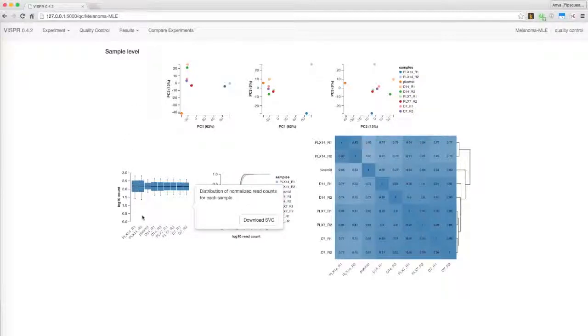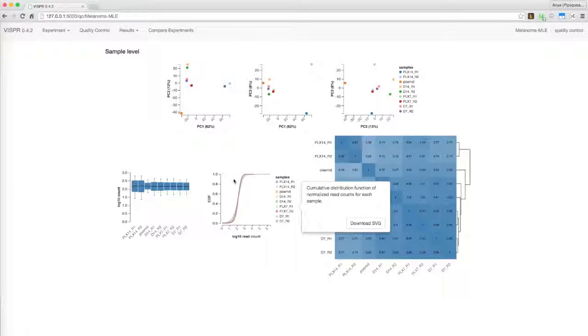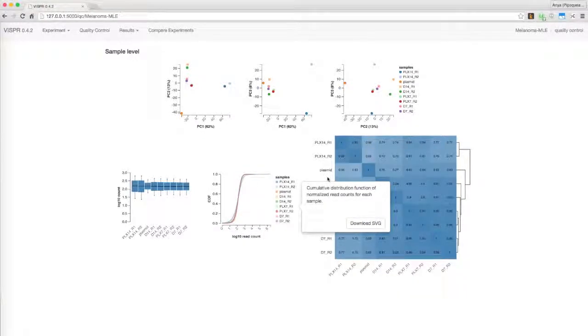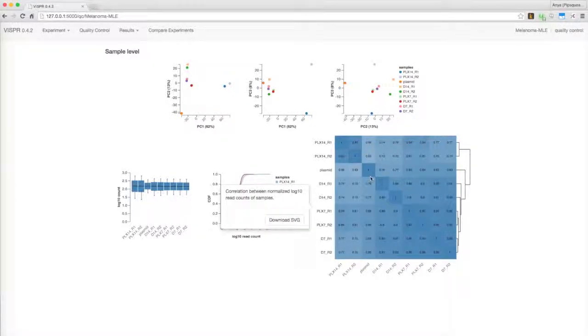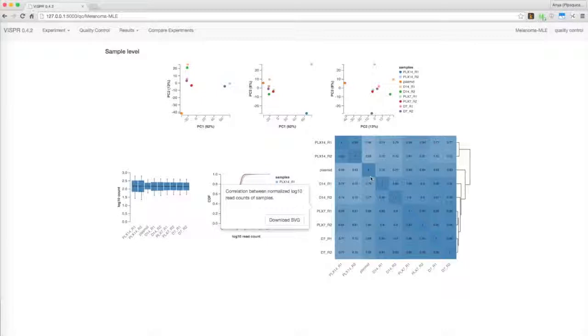These graphs show the distribution of normalized read counts for each sample on box plots and cumulative distribution functions. Similar samples should display similar distributions on all of these graphs. Vispr also displays pairwise Pearson correlations of sample log read counts.